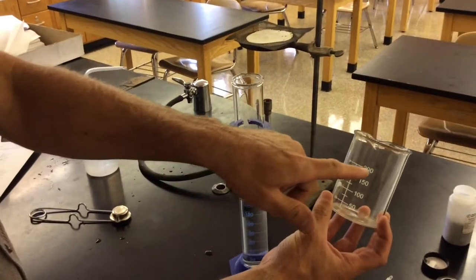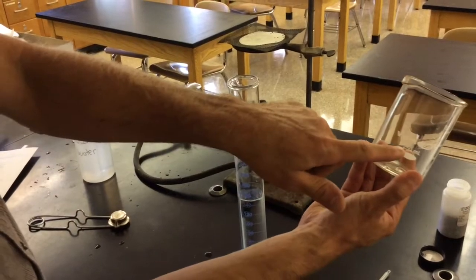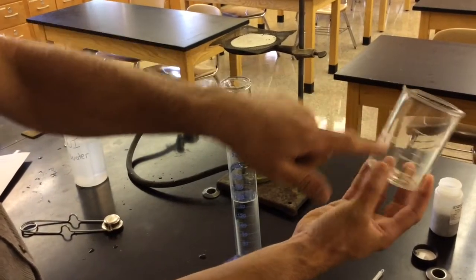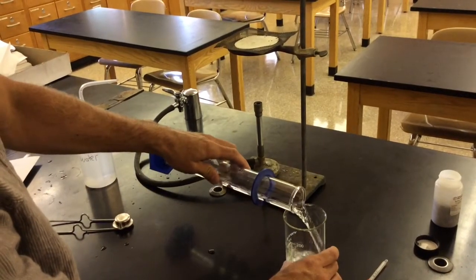Now people get confused a lot. They see the 200 here and they think this is the 200 milliliter beaker, but you go by this number because there's a little room above that. So this is the 250 milliliter beaker. Add the DI water to it.